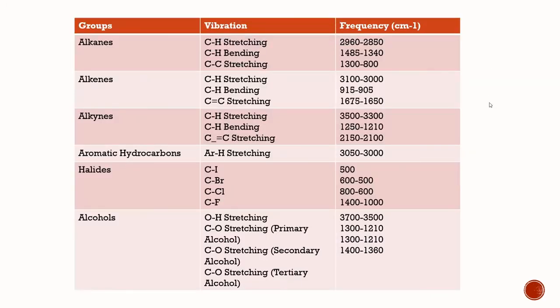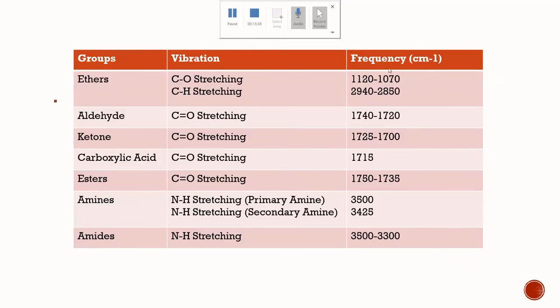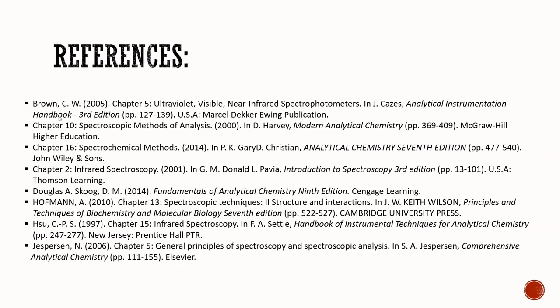The table given here shows the different groups, their molecular vibrations and frequencies. And this table shows the vibration and molecular frequencies of ether, aldehyde, ketone, etc. These are the references.